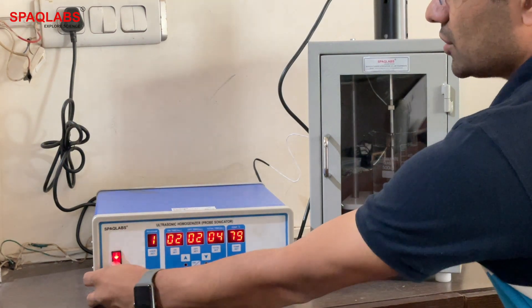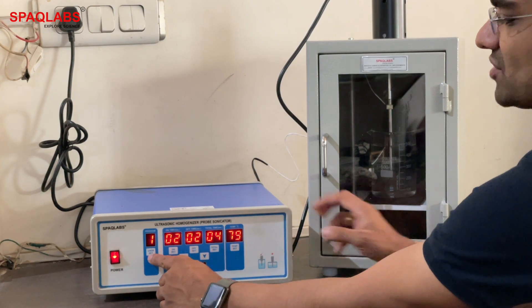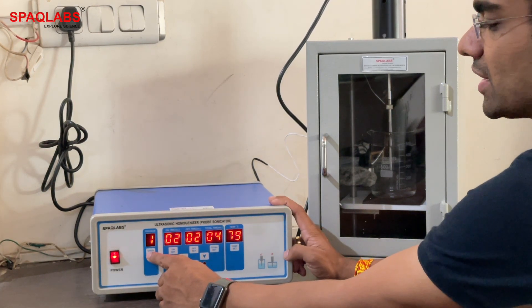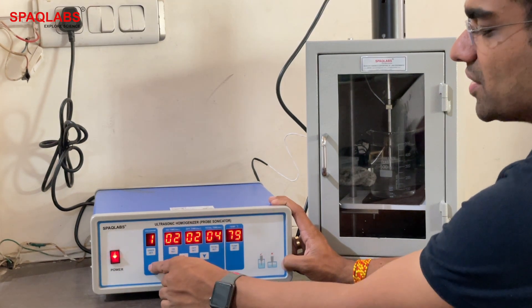Switch on the sonicator. We will enter the user settings. We can set up to 10 programs — click on this to navigate through them.